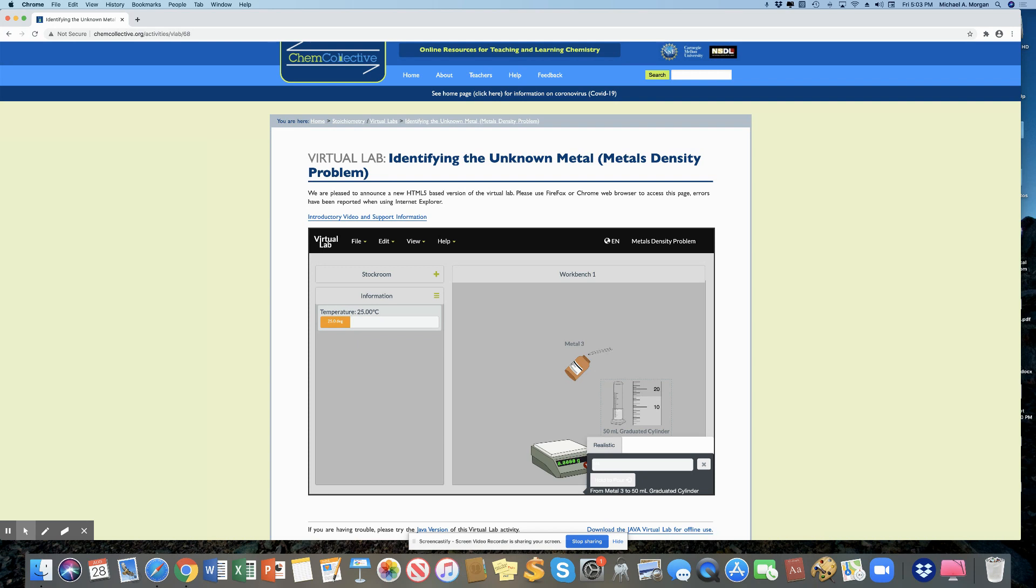So I'm thinking that this one is going to be, let's see, that's a two, a four, six, and eight, a 10. So two, four, six. This to me is looking like it's just at 16 milliliters. I think I've got 16.0.